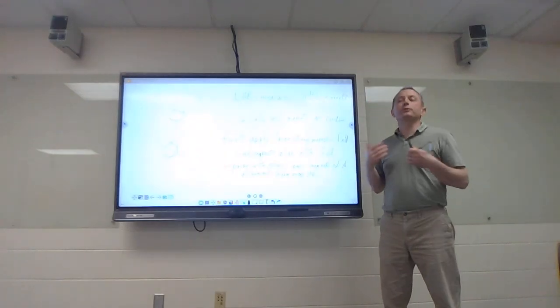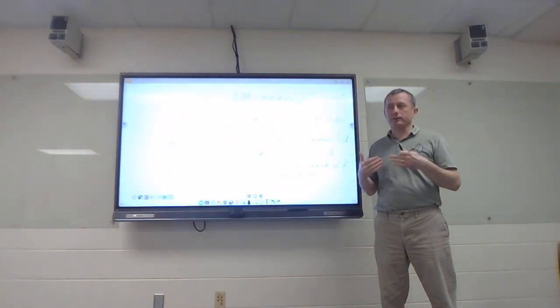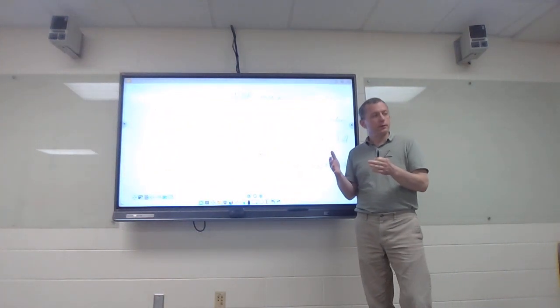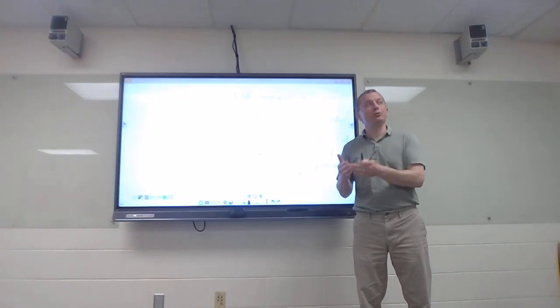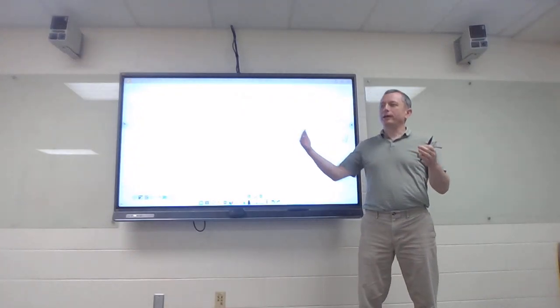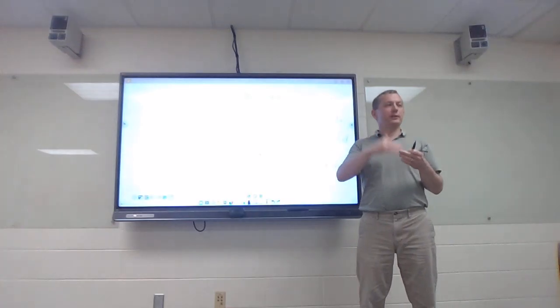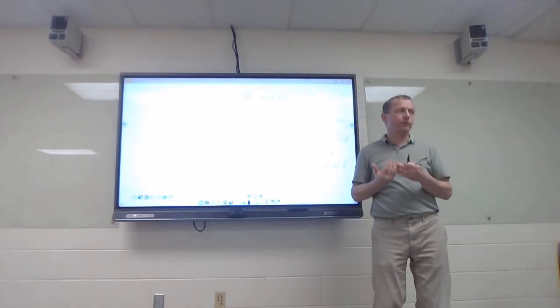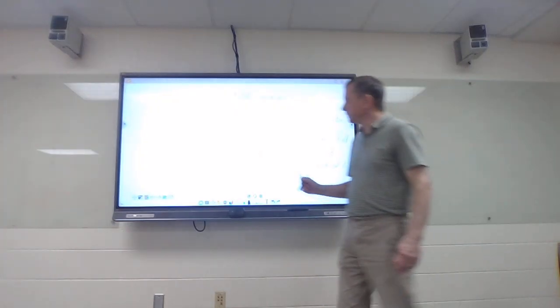Well, at the same time, when we do spectrophotometry, I should say absorbance, if you did use the spectrophotometer, something that has color, or maybe it doesn't even have visible color but absorbs in the UV range of light. What happens there is it's absorbing that light and putting electrons in an excited state. And so you can measure the absorbance of that wavelength of light. Okay?